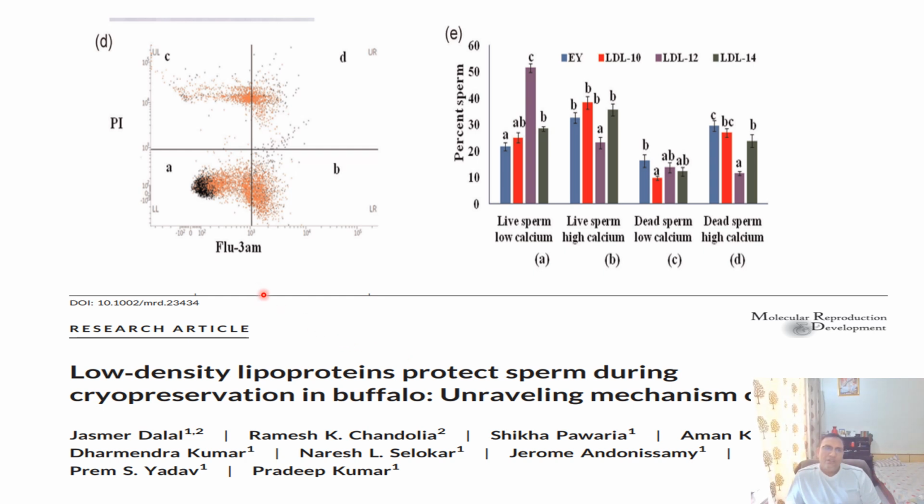So for the flow calcium indicator, we just put the last quadrant plot showing Fluo positive, Fluo negative, PI positive, PI negative, and the bar diagram. So it depends on the data and how many figures the journal allows in the manuscript.